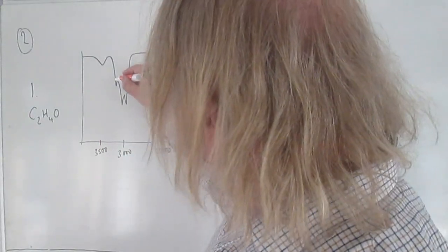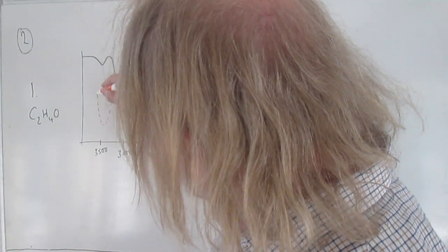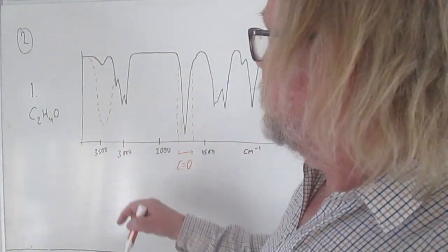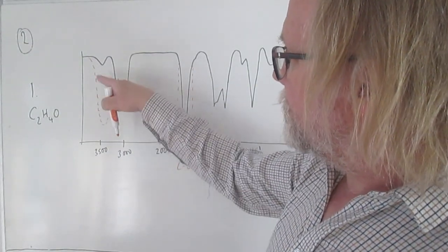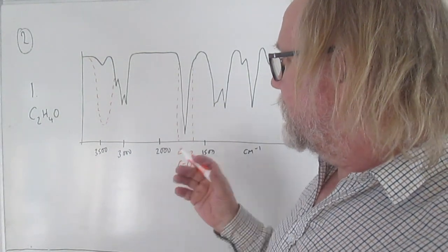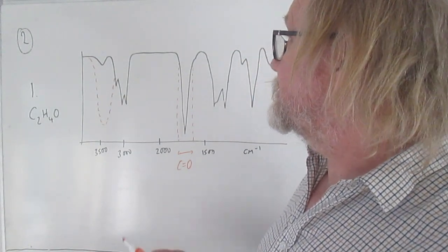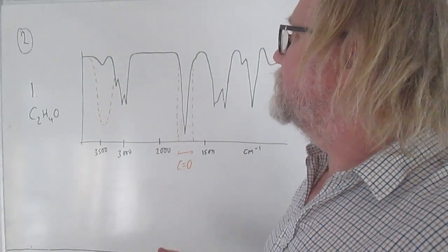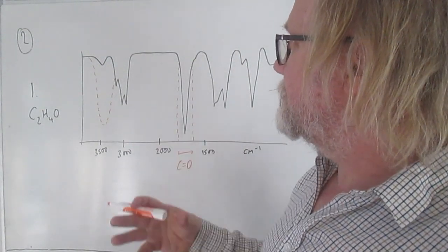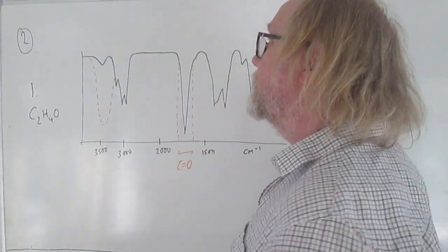But if there were an OH, you would get a peak sort of around there, like that. And it's a strong peak. It's got this very smooth shape, and it clings fairly closely to that range, 3,200 to 3,600. As I say, ignore the little things like that. That's not what we're talking about here. We're talking about a big strong peak. So no, there clearly is no OH there from an alcohol.